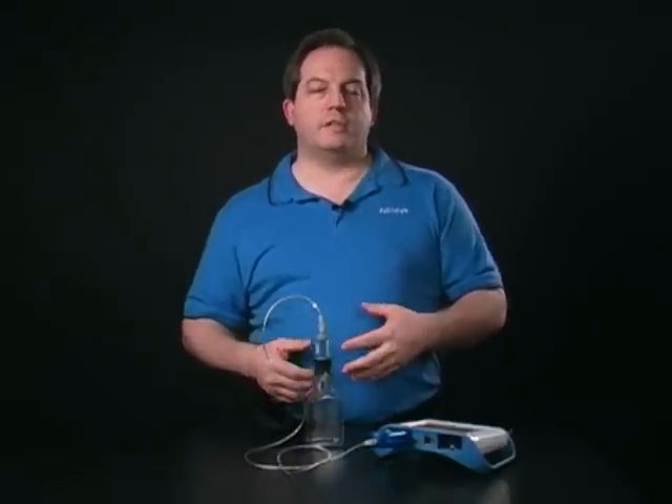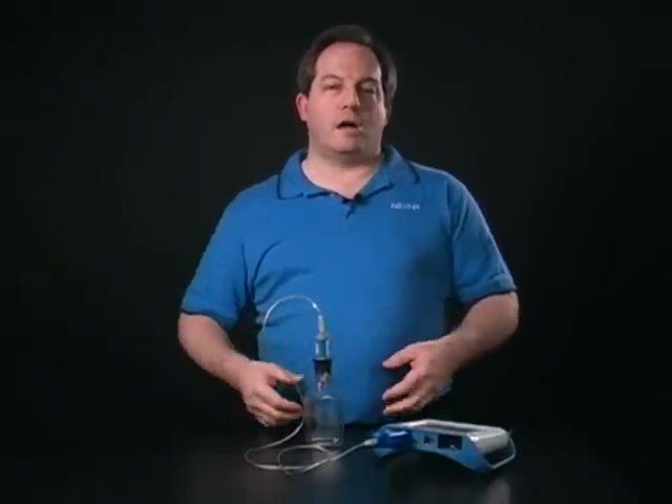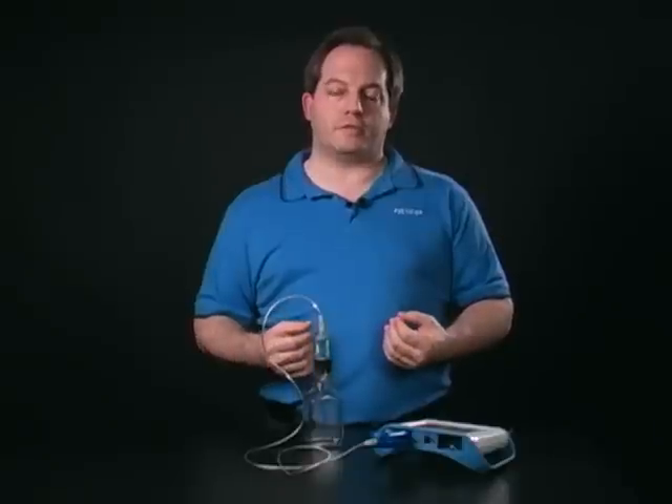You'll see immediately on the screen in your interface that you can measure in either percent oxygen or parts per million. The calibration is actually in percent oxygen, but it's good for both values — the calibration is good for both units, depending on what you're using.